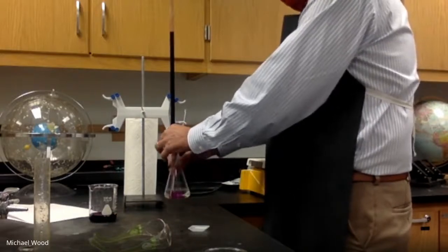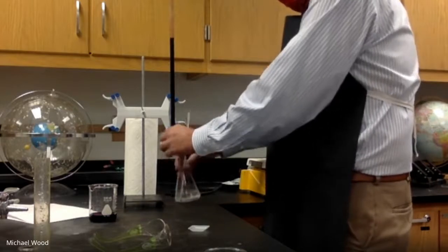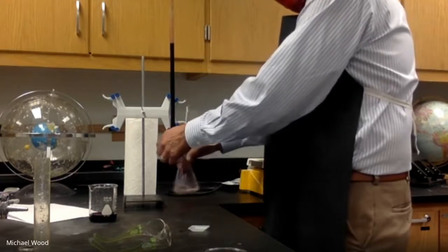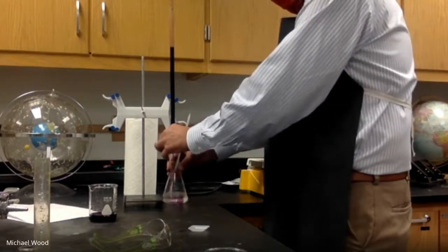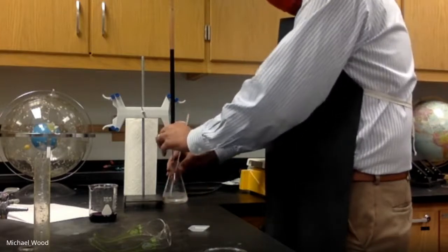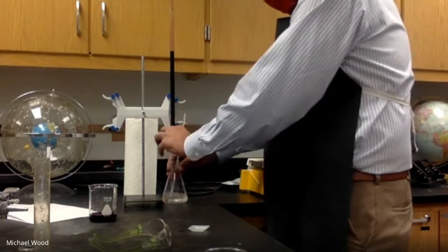Closer, I think. Okay, it's getting closer. And one source of error on this lab is always the color. Let's try and get it.